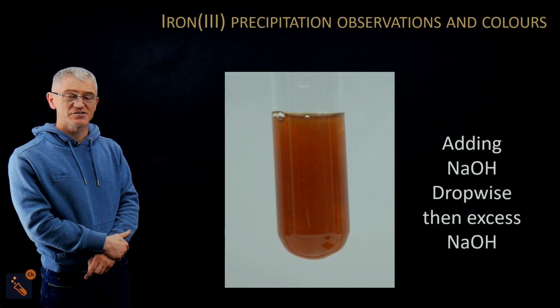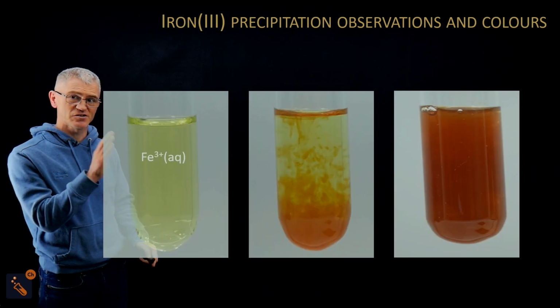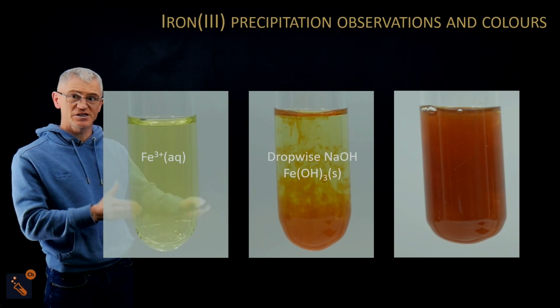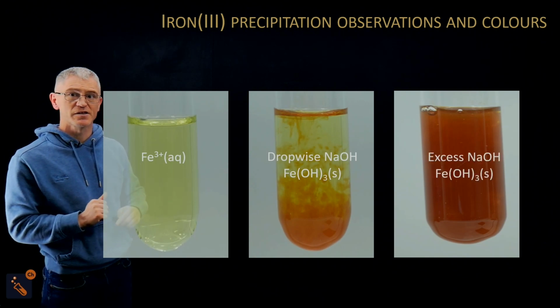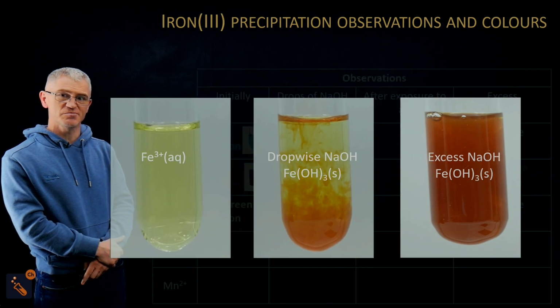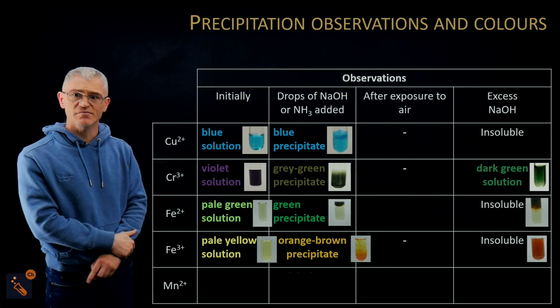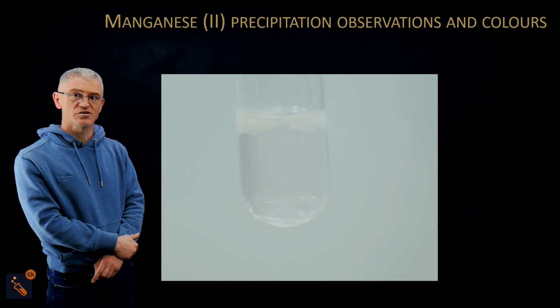Okay, and so let's have a look at the 3 versions now. So iron 3+, the brown precipitate, which is iron 3+ with the iron 3 hydroxide. And then again, you get the precipitate iron 3 hydroxide. So that's one of the simpler ones. So we've now got a table building up. Okay. And then let's go to the last one.